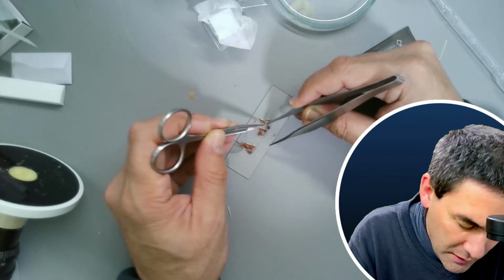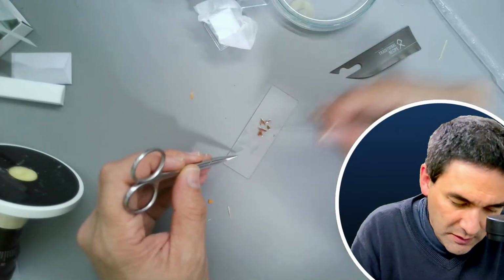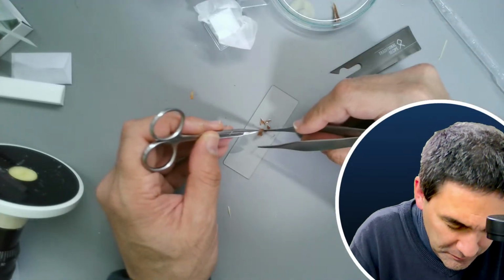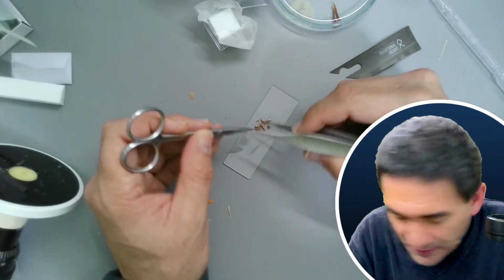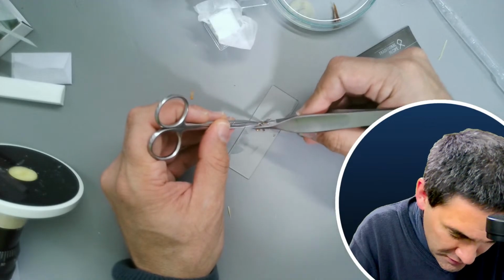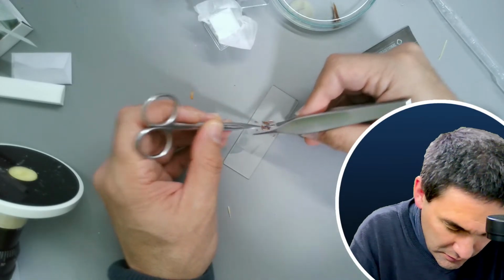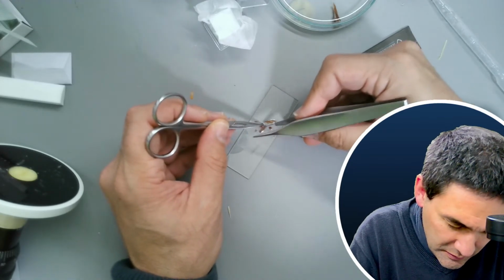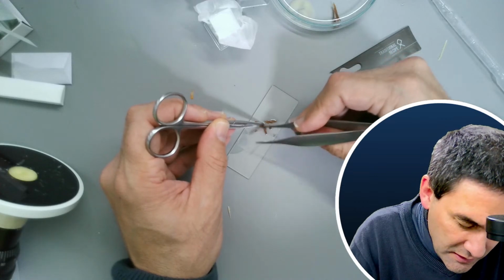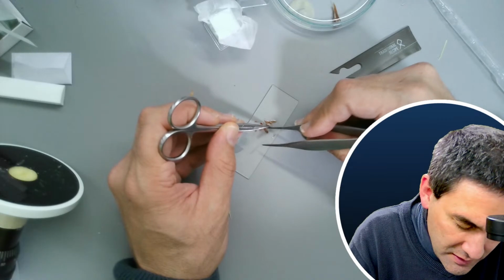Maybe I should add some hot water to the whole thing here. Okay, let's put this in here. Has anyone ever put some Nordic elk jerky under the microscope, or is this the first in the history of humankind? I don't know. So let's macerate this. I think what I'm going to do is try actually boiling this.